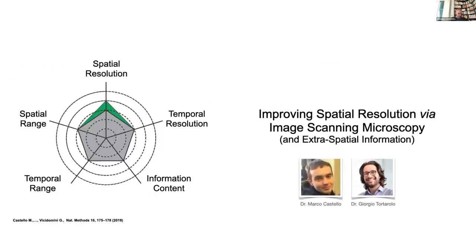So the first one is a project in which we explore the new spatial information provided by the detector to improve the resolution of a confocal system, or in general of a laser scanning microscope system. And we do this through the concept of image scanning microscopy.